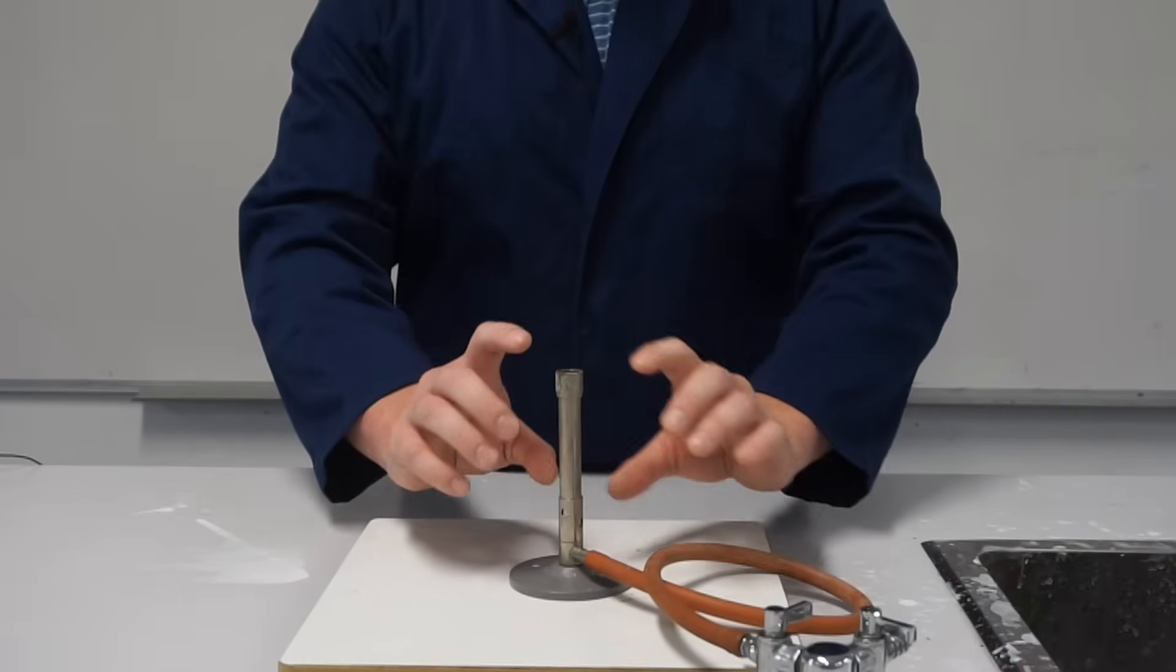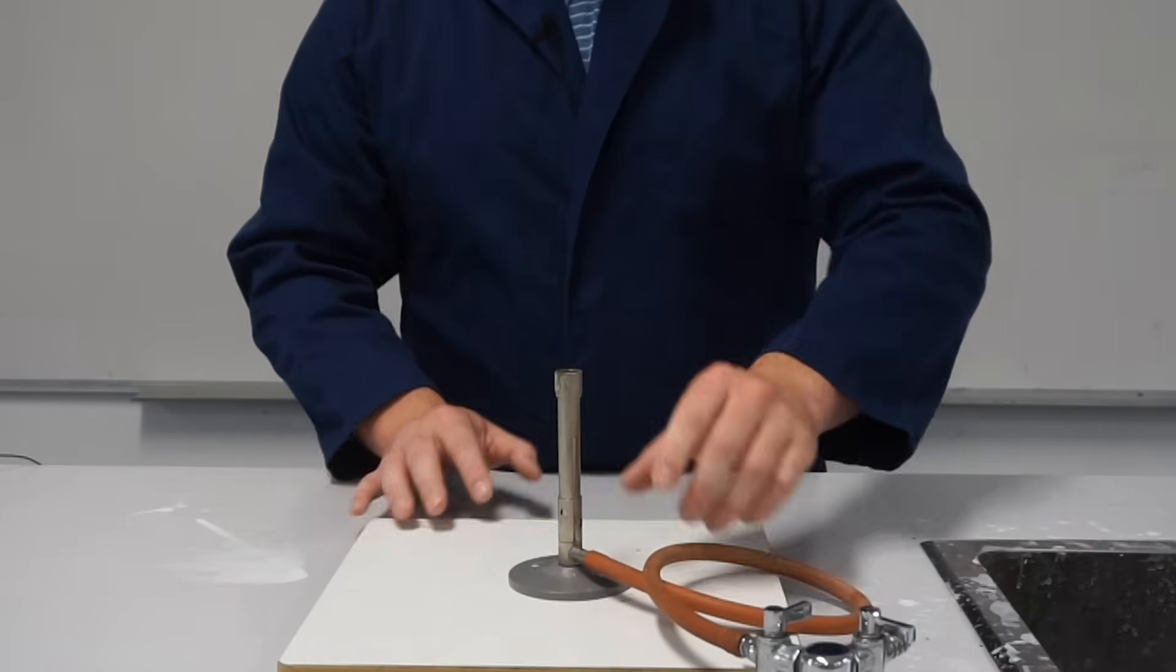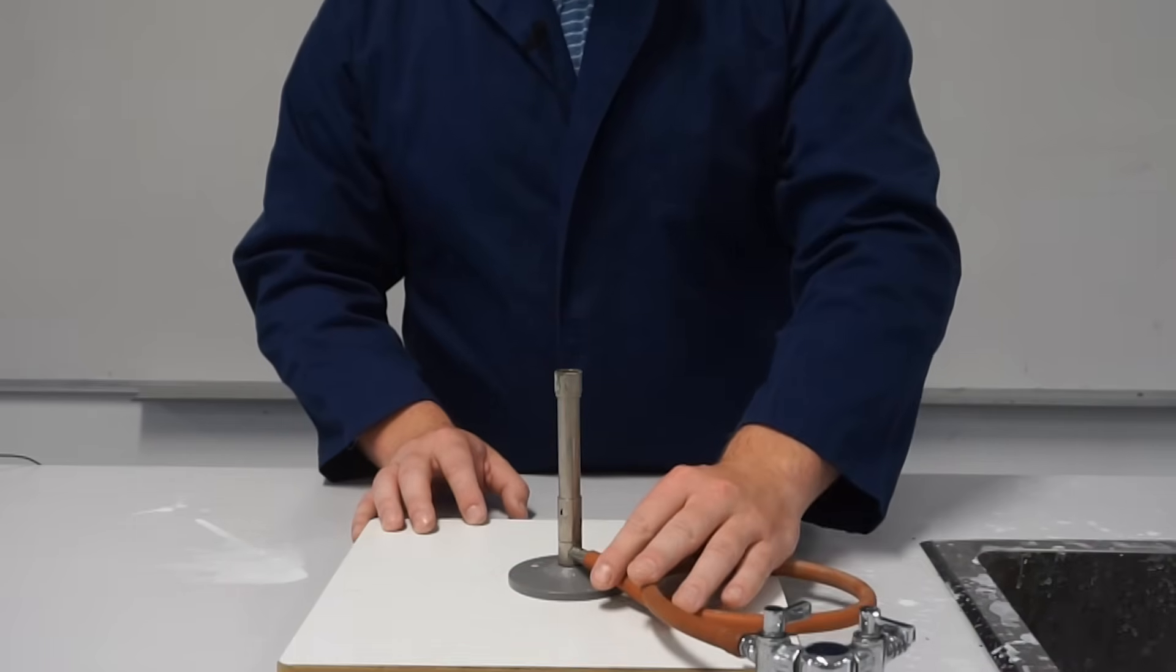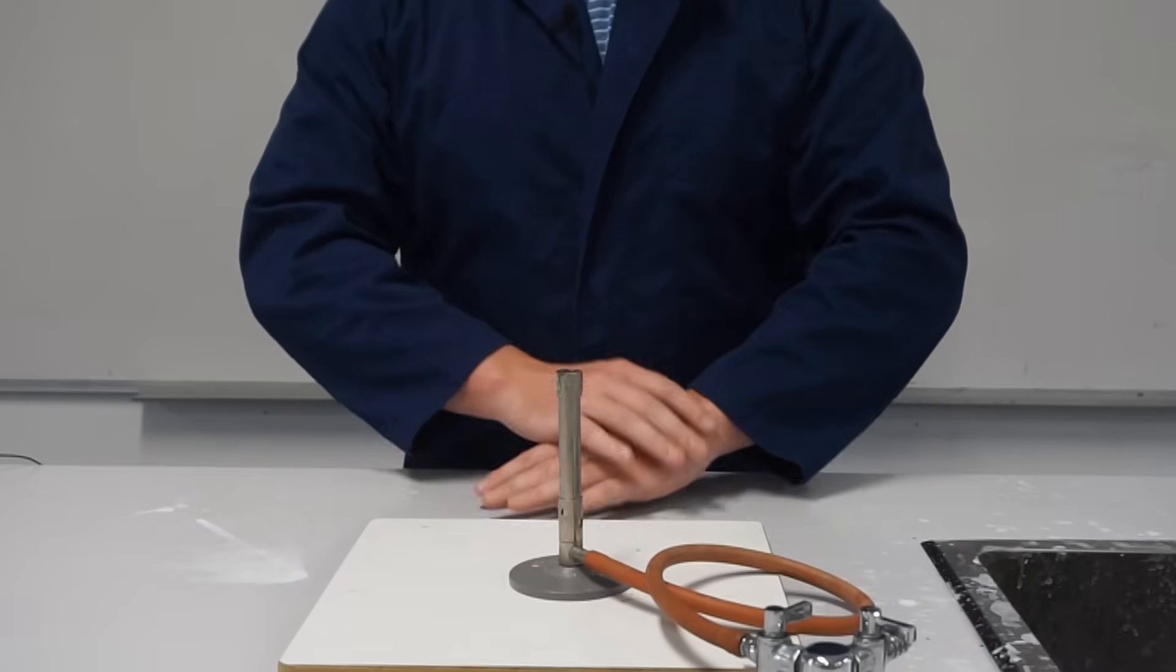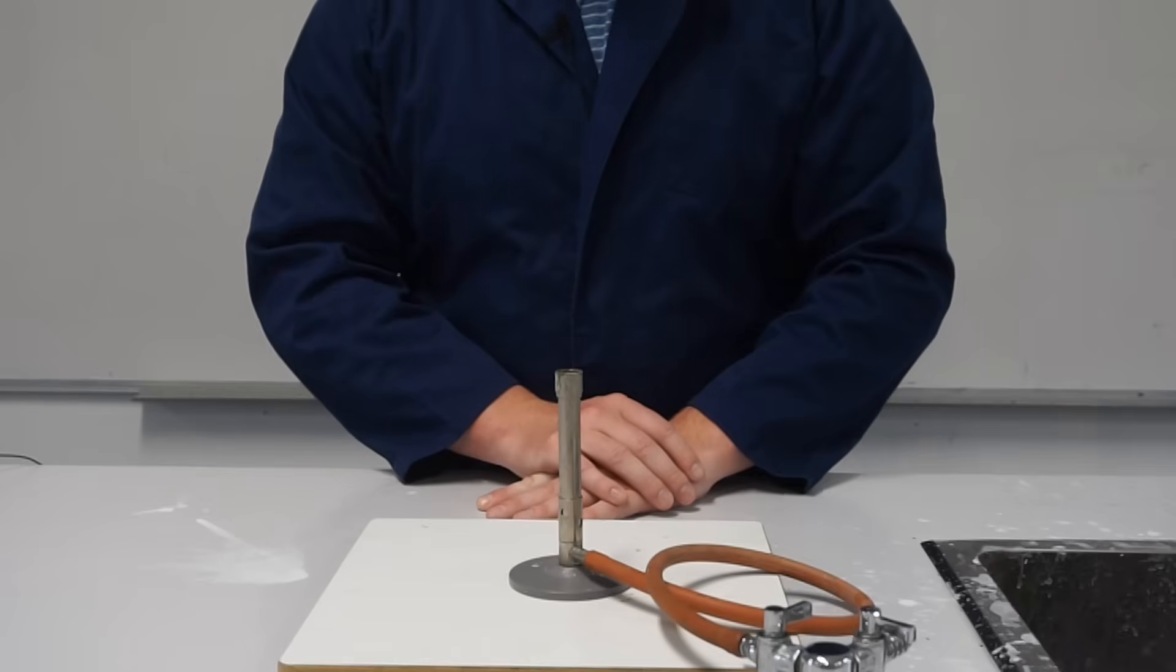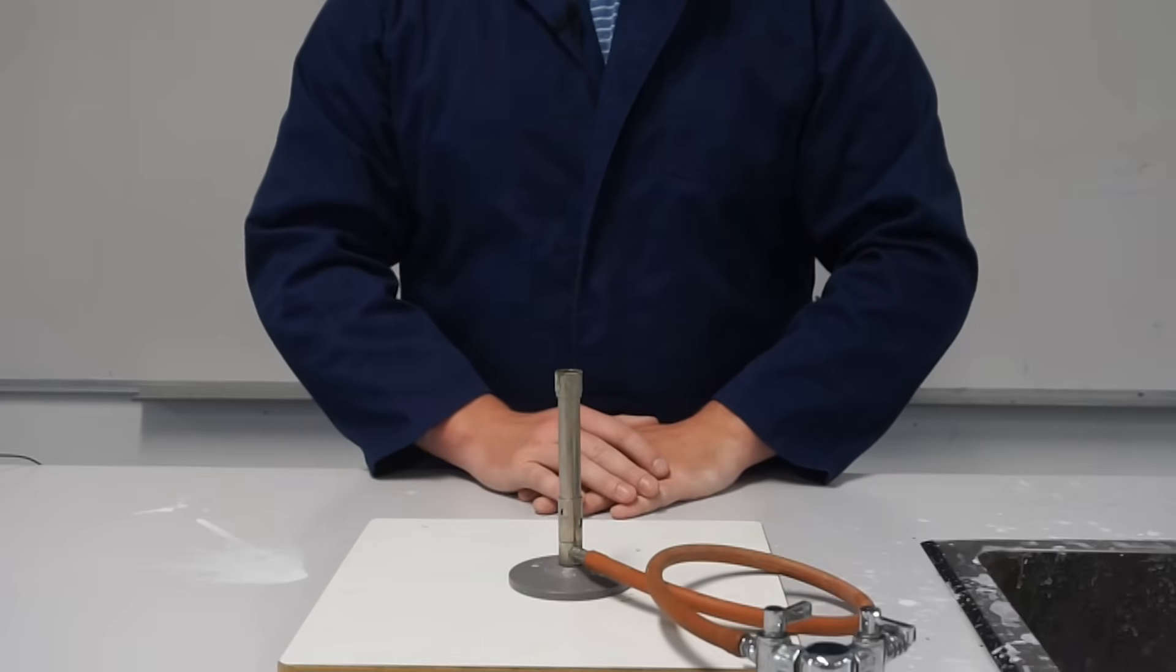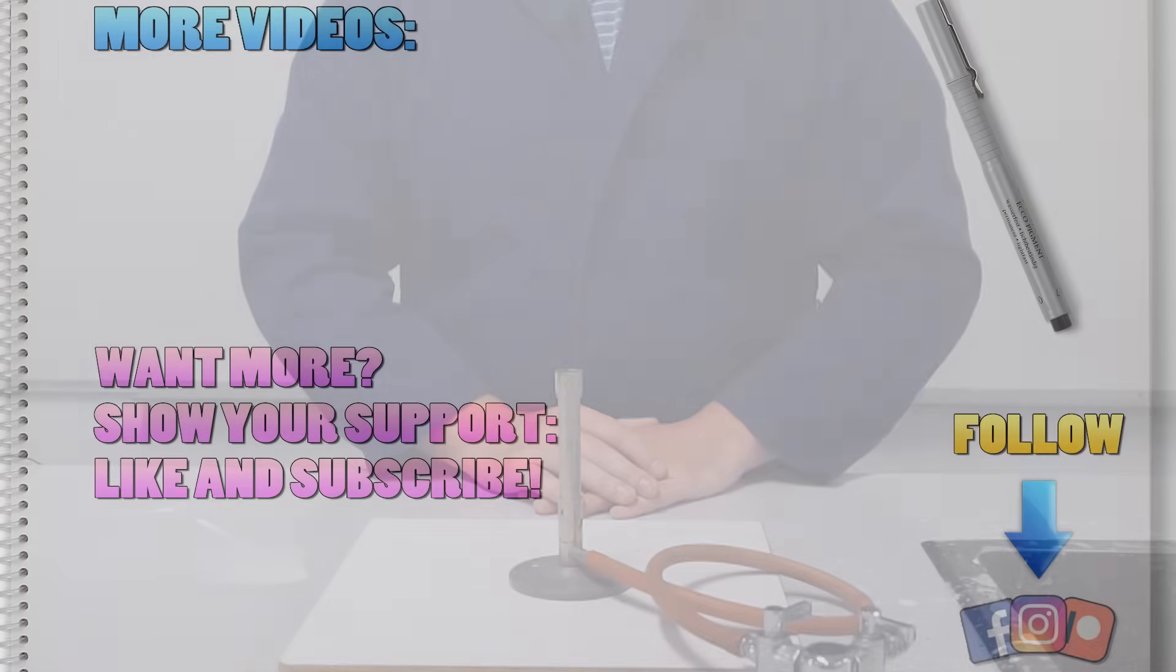And that's it for today. We've gone through some of the key parts of the burner, how to safely connect it and inspect it, as well as some of the safety equipment and how to safely light and use our Bunsen burner. I hope you enjoyed it and I hope you get a lot of use out of your Bunsen burner.